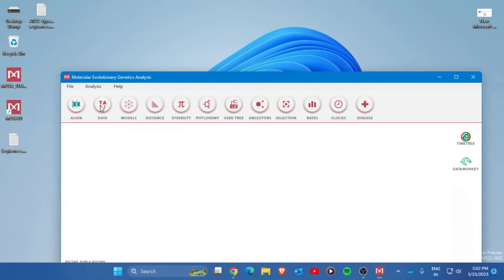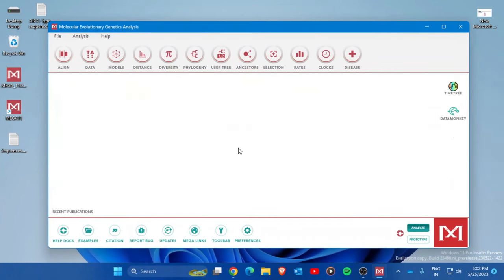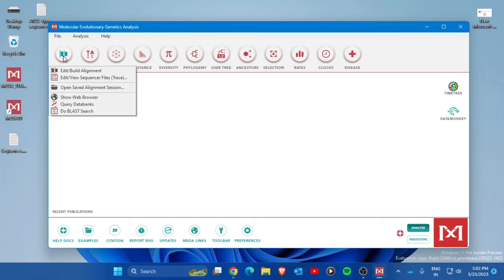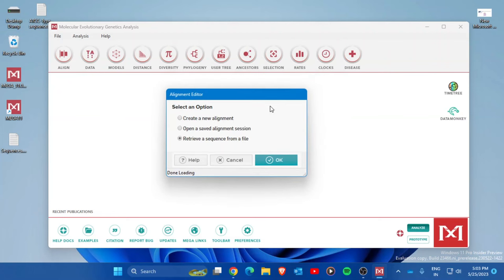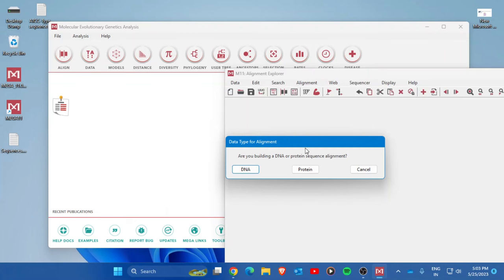Once MEGA is installed, open it. The MEGA interface will appear. The first step is to perform multiple sequence alignment. Press on the Align button, then choose 'Build an Alignment'. A new window will open — select 'Create a New Alignment' and press OK. It will ask whether you are building a DNA or protein alignment — select DNA.